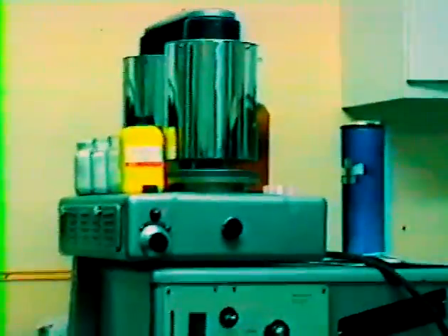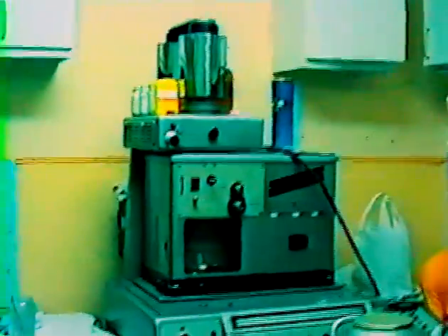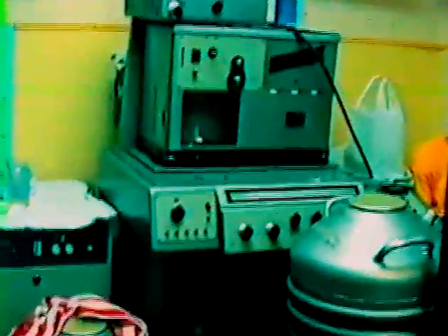And this is a derivatograph. This is a Hungarian-produced one for measuring the mass loss, the heat evolution or heat absorption during the heating up of the sample. So this has been used particularly in our former topics when we investigated the thermal decomposition of different inorganic compounds, chlorides, chlorates, and perchlorates particularly.